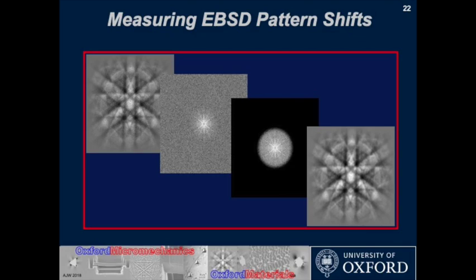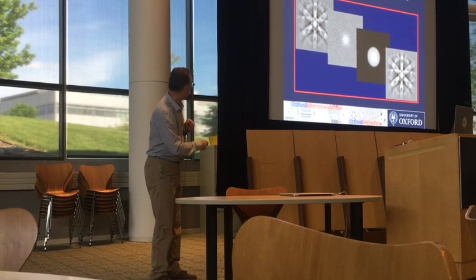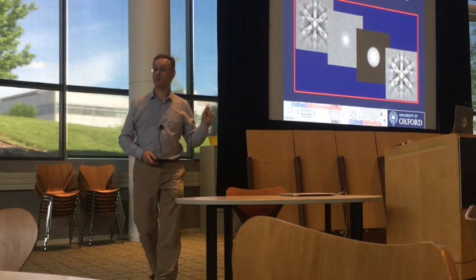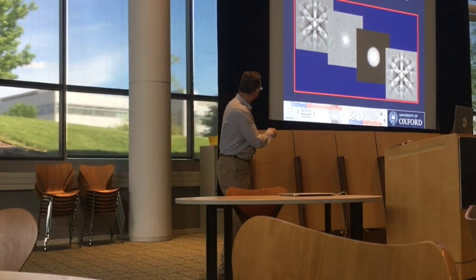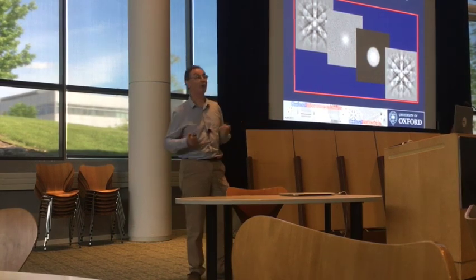But it does mean that we go from, well, here's a region of interest, our diffraction pattern. We go into the Fourier space, and now distance out from the origin gives us the frequency with which there is signal, and the brightness of the spots tells me how much signal. There's a phase in there as well, which I haven't shown. But what you'll see is most of the information is in this central region. The rest of this stuff out here actually is just noise.